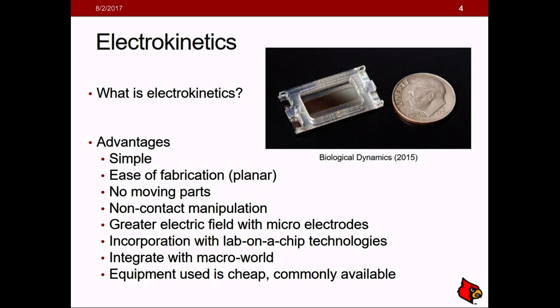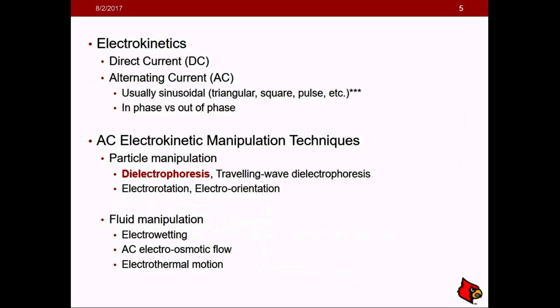And because there are no moving parts and the fabrication is straightforward, you can incorporate it with other technologies. You can integrate it with other equipment, integrate it with the macro world in terms of interfacing with your fluid, your syringe pumps, interfacing it using a card holder to make the electrical connections to attach to your waveform generator. So it's straightforward to apply this technique.